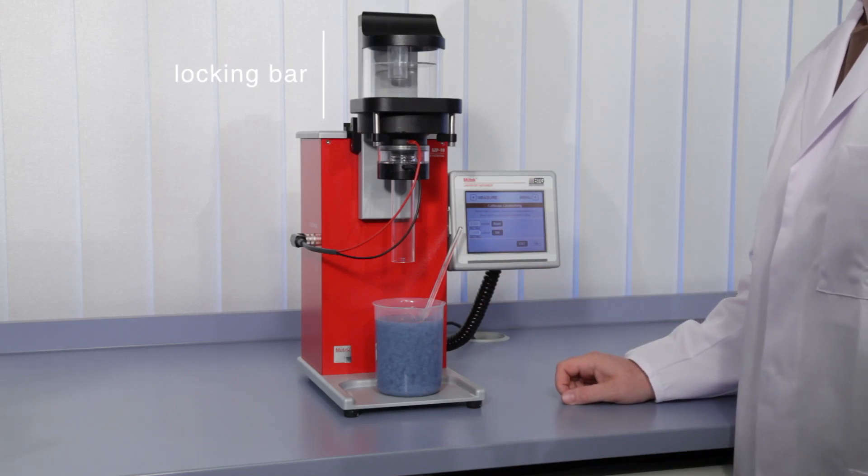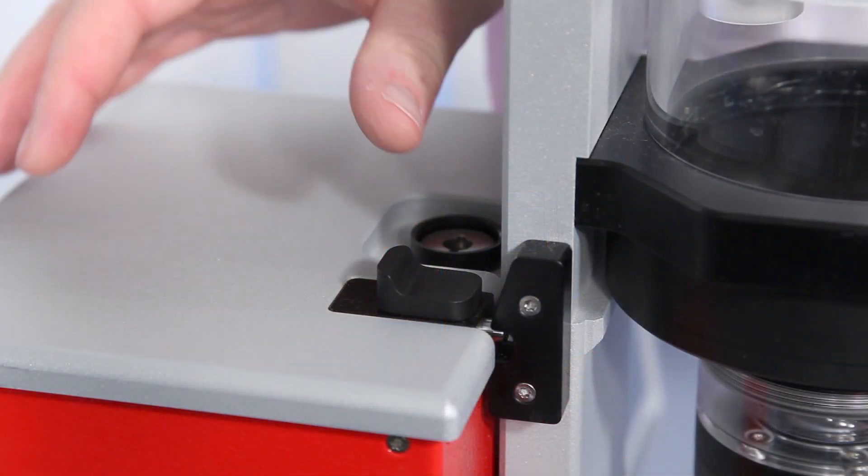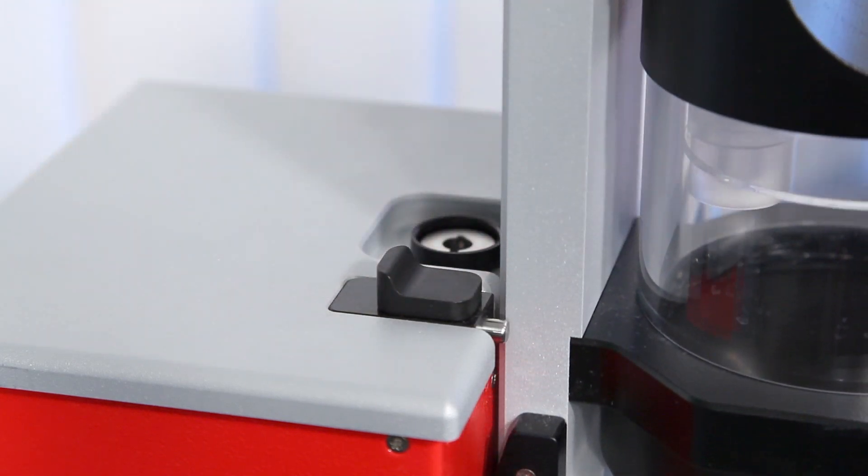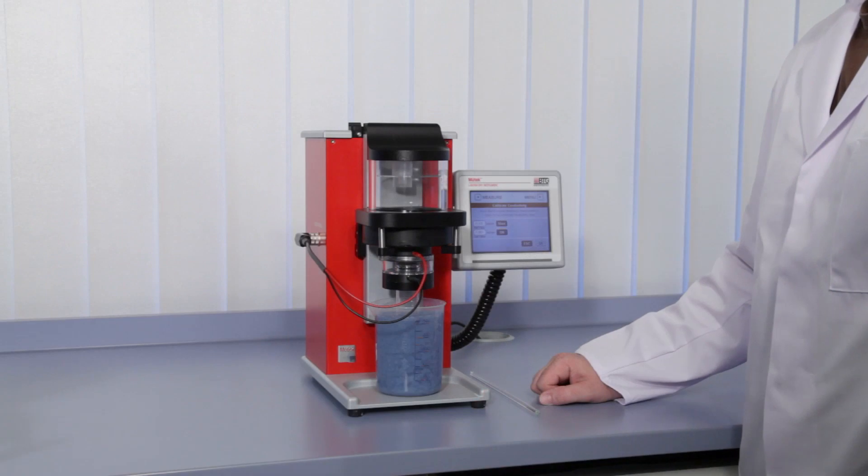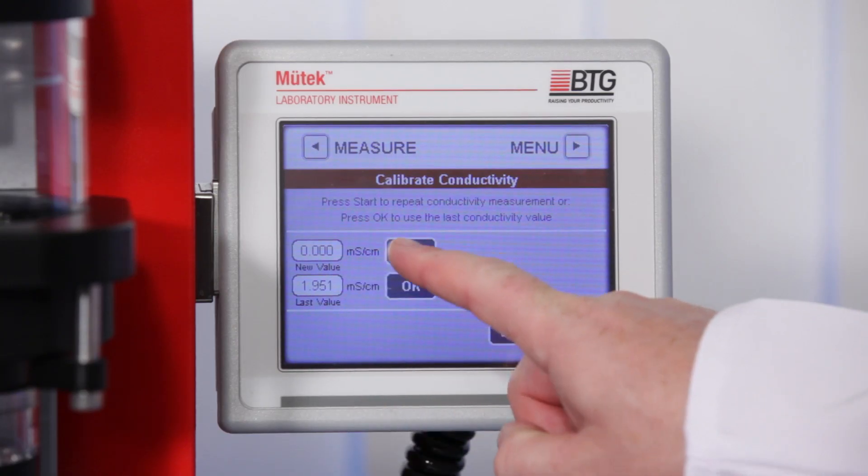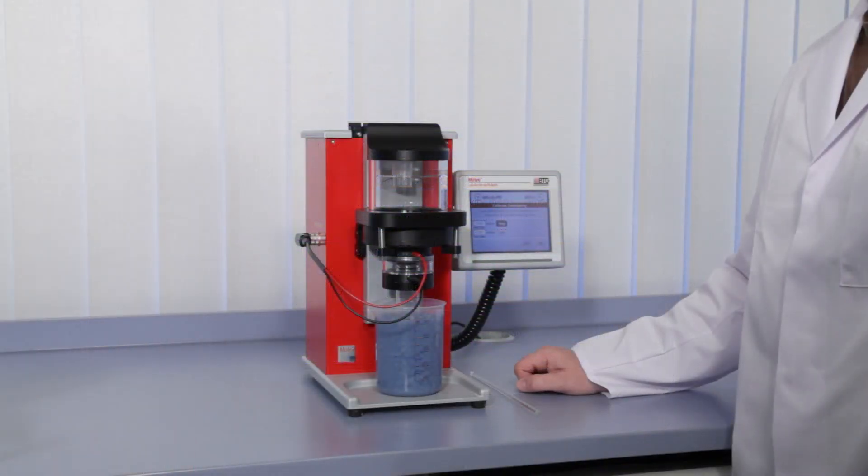Push the locking bar to release and lower the measuring cell. Then, press the Start button and the SZP will perform a conductivity measurement.